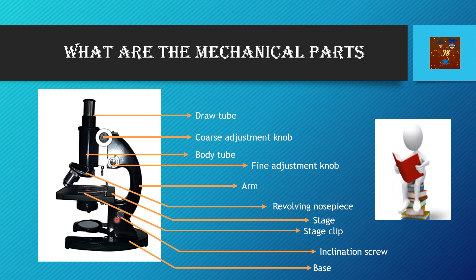You can see this is the stage, this is the stage clip, this is the inclination screw or inclination knob, and the last one is the base. So these are the mechanical parts of a compound microscope.